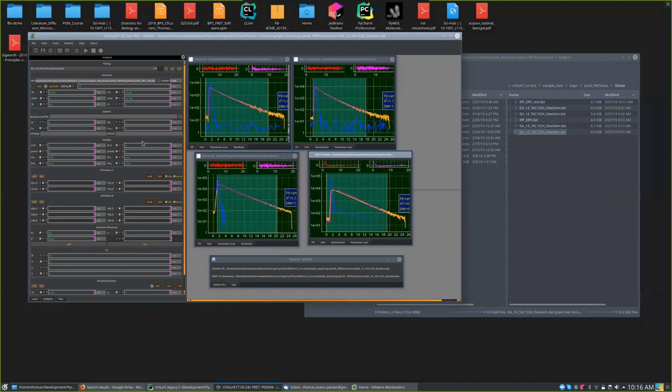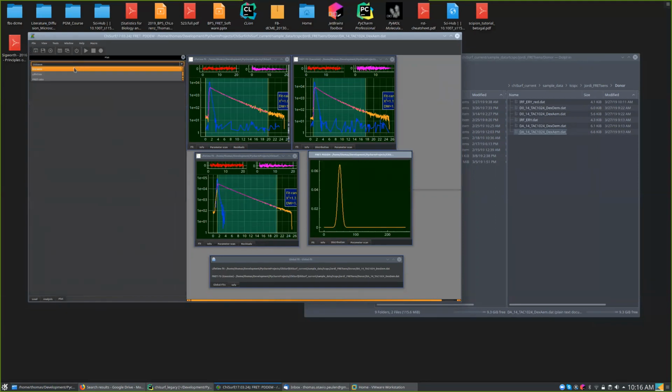And now we just talk about all these parameters here in this PDDEM model. As I said, this is just something that is multiplied to all the prefactors. So you imagine here in this distribution, you don't have a distance distribution. In fact, what you have is a distribution of rate constants. Here you have a distribution of rate constants. This looks a bit funny now because we have this Gaussian, which is Gaussian in the distance. We have now discrete lifetimes. So then of course we get discrete lifetimes here, and we get positive and negative factors because of this PDDEM model.